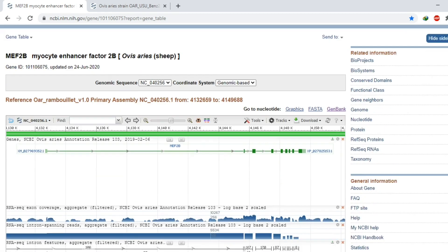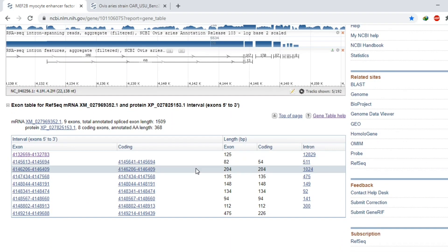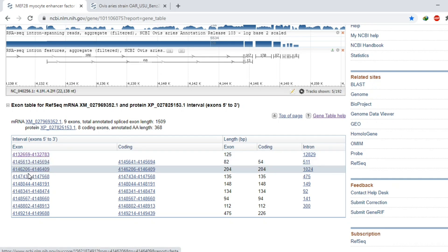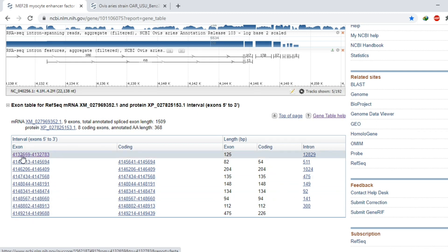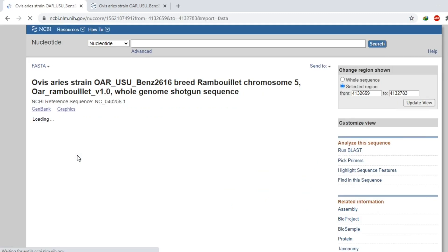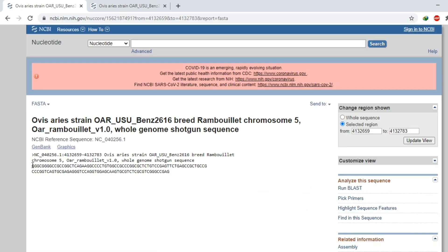Scroll down. As I mentioned, our gene has nine exons, and the complete details of these nine exons are provided here. The first exon starts from position 659 to 783, and its total length is 125 base pairs. If we are interested in downloading the sequence of this first exon, we can click on it and the sequence will appear.